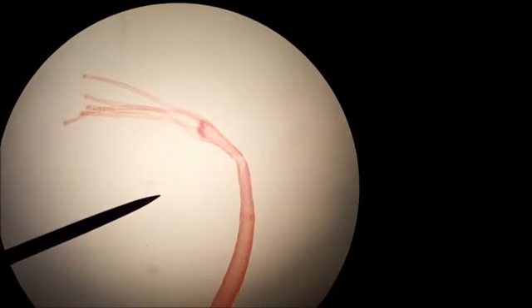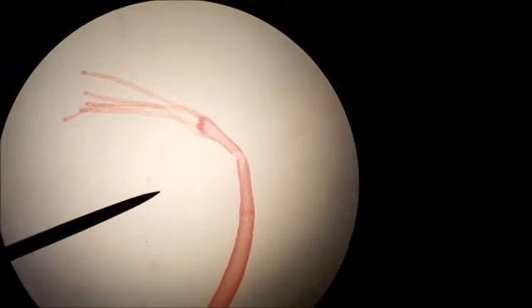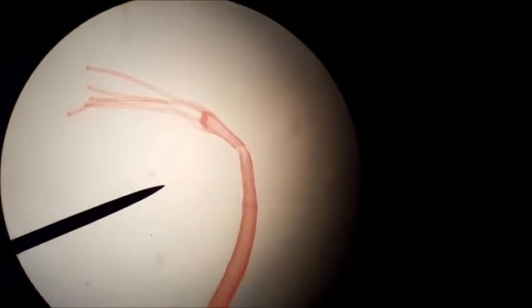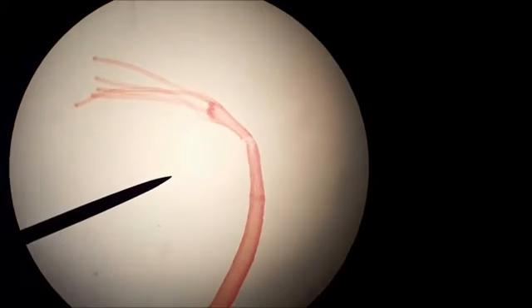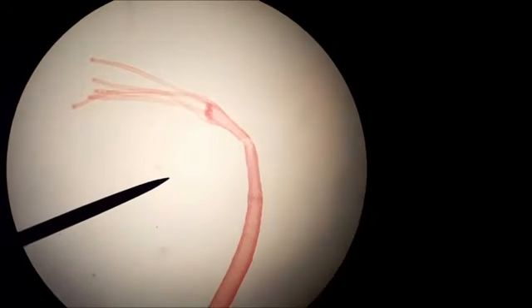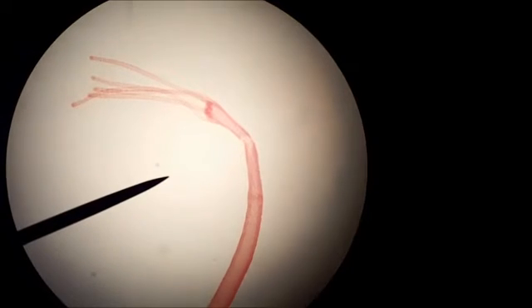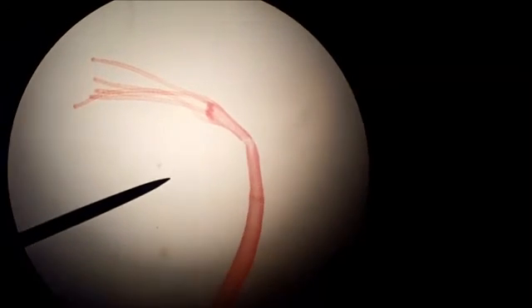Hydra is basically a cnidarian or jellyfish type relative that is a two-layered sac. There is an outer epidermis, there is a gastrodermis on the inside, and there is a separation of packing material called mesoglia.